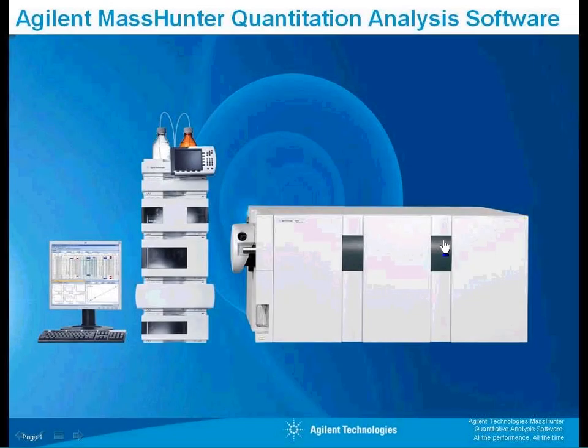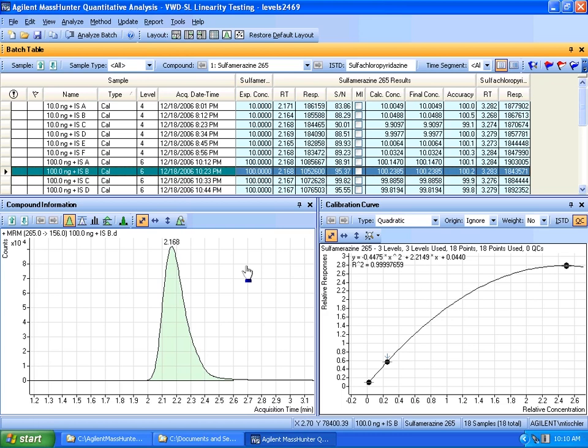2D signals. Now, 2D signals are defined as non-3D signals, meaning non-mass spec signals, that are often used in conjunction with mass spec. For example, in LC-MS/MS, it's often the case that you're bringing your methods from an LC detector like a UV detector, and then you're going to create a mass spec method from that. So having the UV signal is extremely important as a reference and as a confidence builder that your method is working out. Let's take a look at the application.